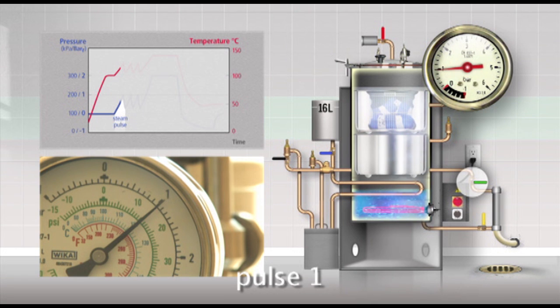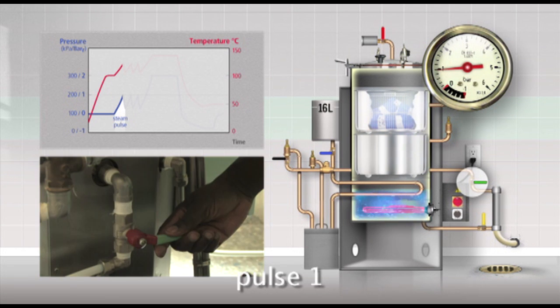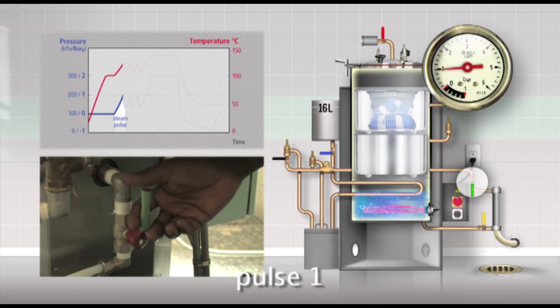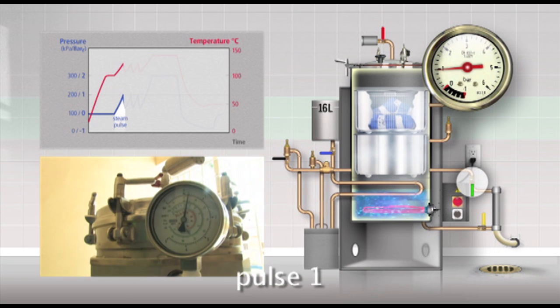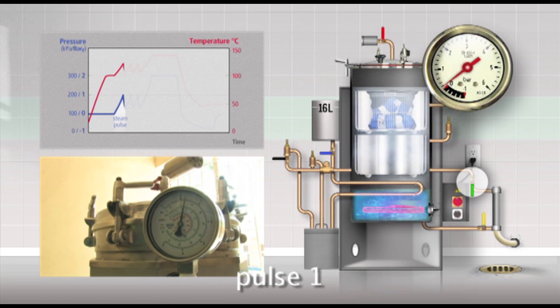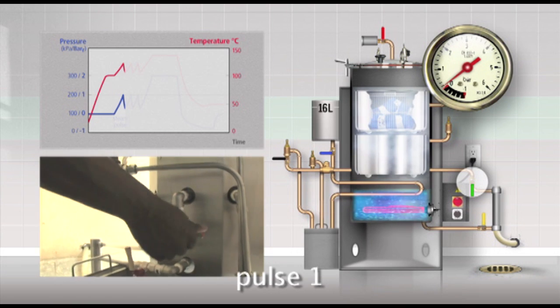When the pressure has built up to 1 bar, open the green valve, the pressure release valve. Let the pressure drop to 0.2 bar and then close the green valve.